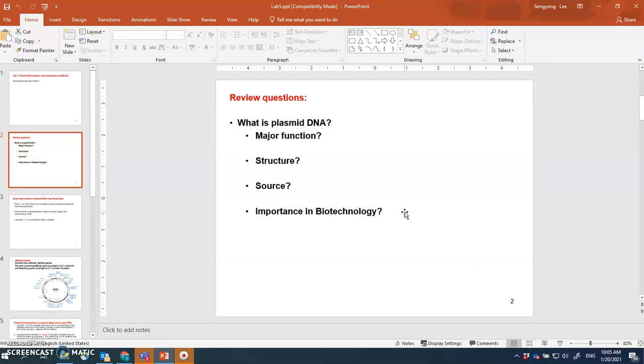The reason is, a gene that's existing in maybe double-strand DNA cannot be readily delivered into a cell, because when it's delivered as just a linear DNA, it can be degraded very quickly by DNase enzymes that are found in cells. So instead of delivering as linear DNA, you want to deliver your gene inside of the plasmid DNA, as a kind of recombinant form. Recombinant meaning your gene of interest is recombined, added to the plasmid DNA, so it gives you a full circle.